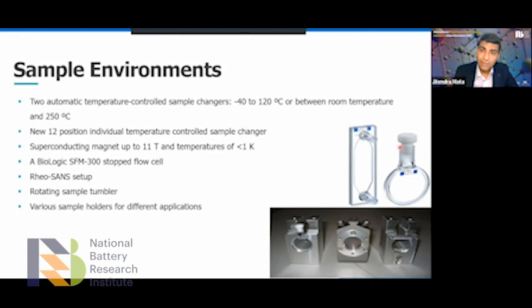If your sample can't be put in this one, you can actually use something like that, like a demountable cell. And we also have a lot of custom made holders. So for example, if you are interested in films or metal films or something, you can just stick it in front here, right? And this is a demountable cell. So it's like 2 glass slides, quartz slides, and you can load your sample between these glass slides. So this goes into that 20 position or 10 position sample holder.